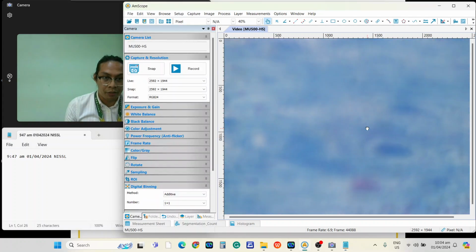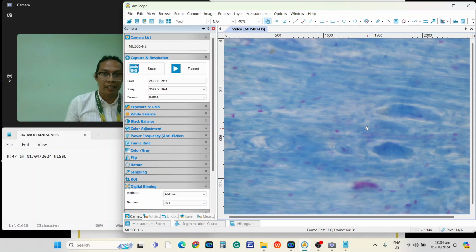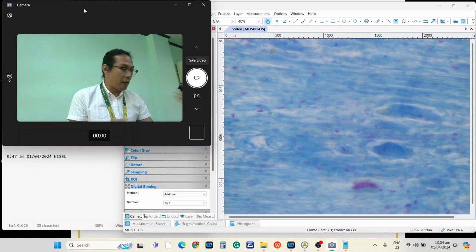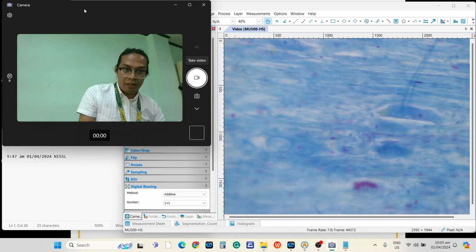Okay, balik na tayo doon sa majority ng slide. So that is yung mismong structure section ng slide. So again, that is a Schwann cell, another Schwann cell. Now, yung myelin sheath na pinoproduce niyan, kapag nasa section siya, minsan nalulusaw, nawawala siya, natatanggal siya sa fiber. Kaya may makikita tayong diagonal lines running across the myelin.